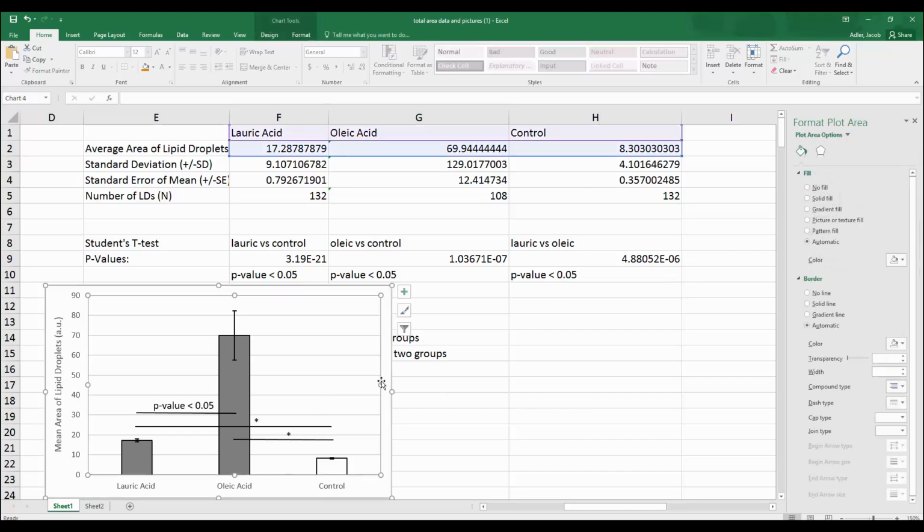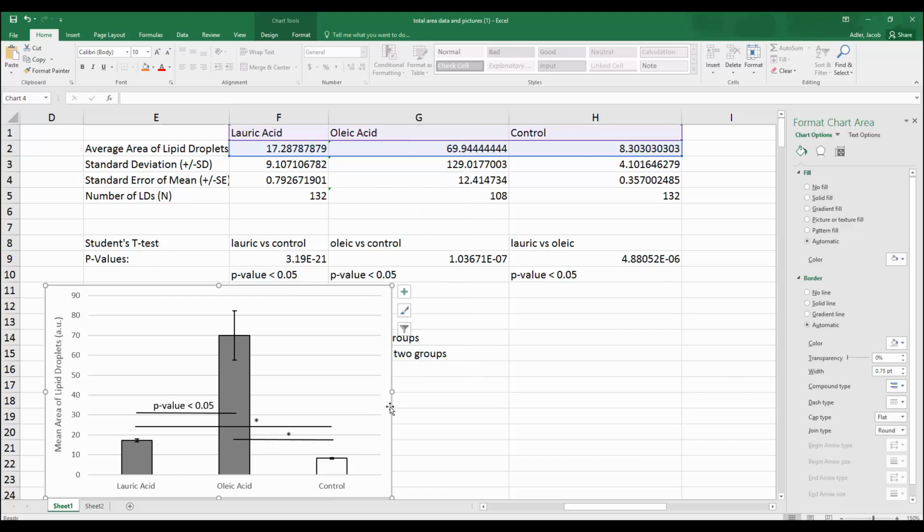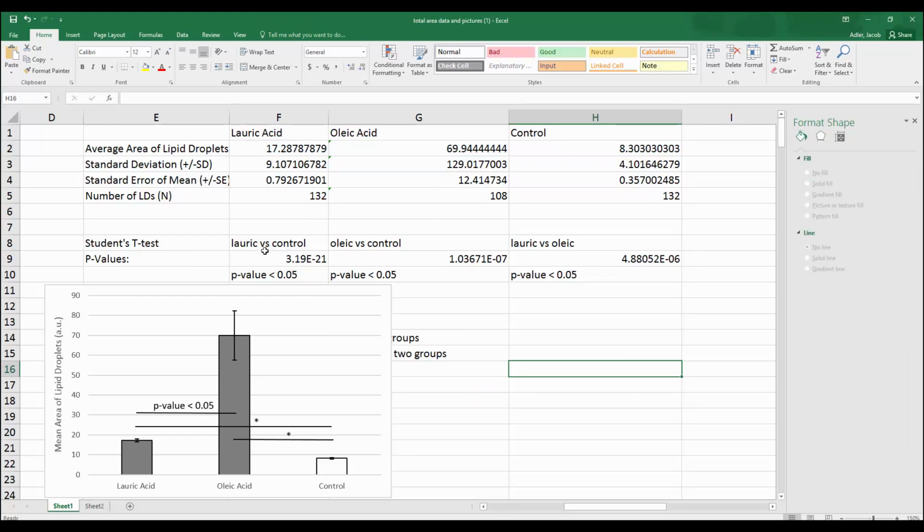And then you want to make sure this graph gets copied onto your website effectively. So you can just save and manipulate the graph. You can copy this and make it into an image, because sometimes, and there's different ways you can do that, but I would save this multiple ways. I would save it as a JPEG and as a TIFF, and you can do that a couple different ways with Paint or other Photoshop programs. And make sure you're saving all your data in multiple places. The last thing you want is all this hard work and nothing shows up.